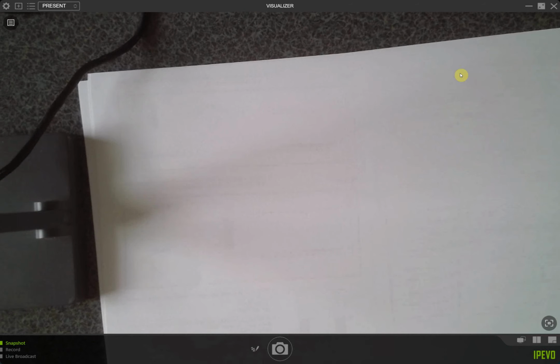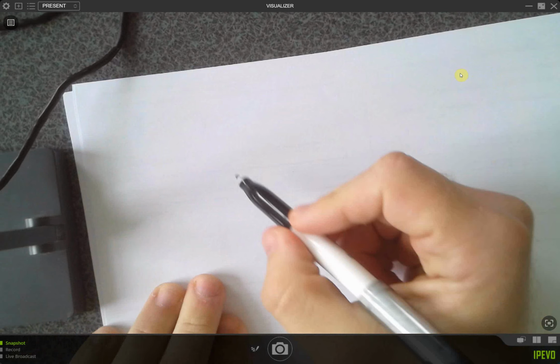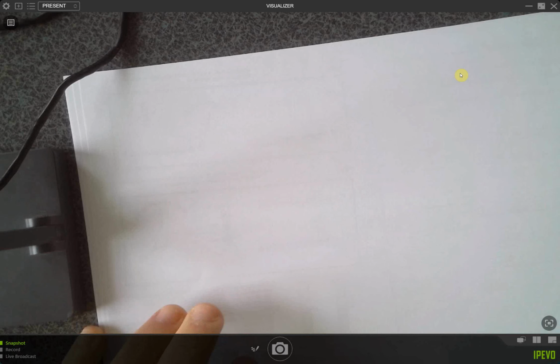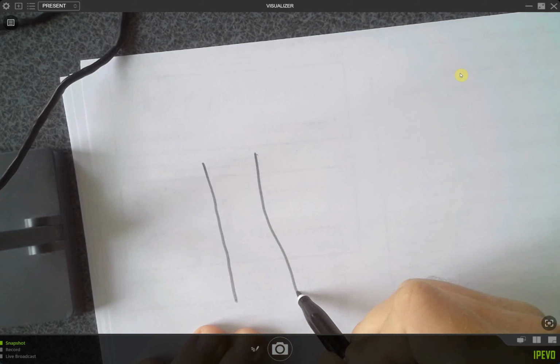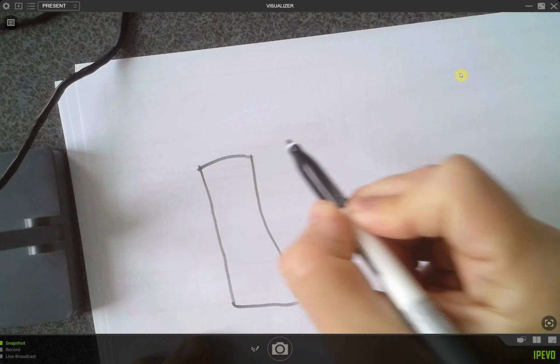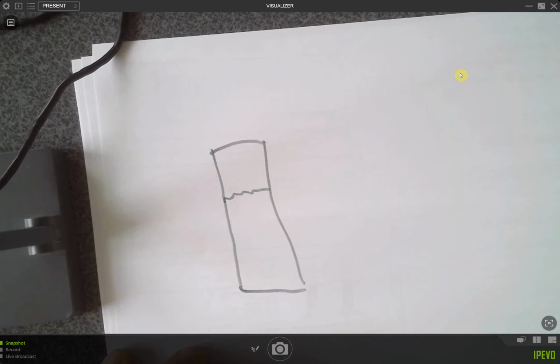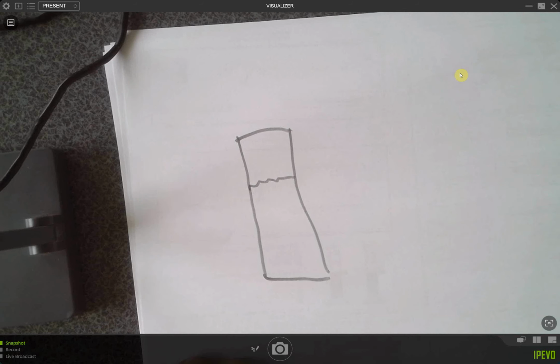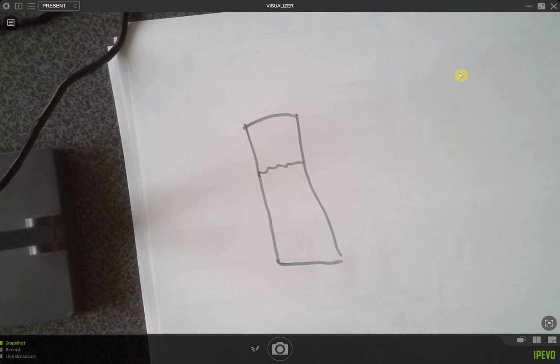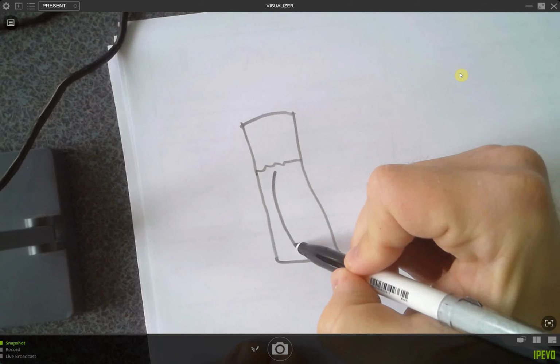So I'm just going to start off by drawing the cylinder that you guys are working with today. How we're using those measuring cylinders that we've just been using today. So something like that. And so you've filled them up with water or sugar. So you did both ways. That group over in the corner, just listening really quickly. All right, so you had your measuring cylinder, and then you had a bag in the middle of it.